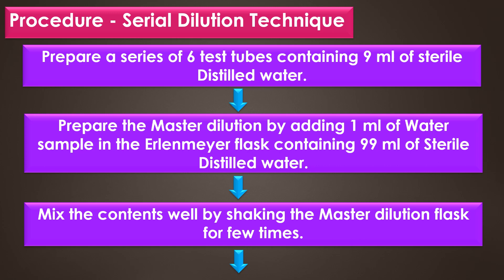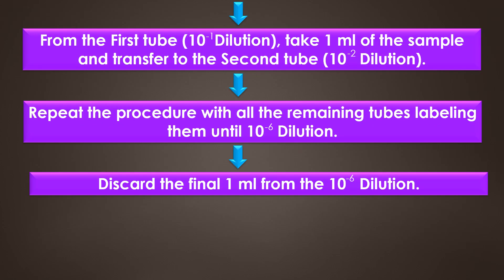First, prepare a series of 6 test tubes containing 9 ml of sterile distilled water. Prepare the stock dilution by adding 1 ml of water sample into the Erlenmeyer flask containing 99 ml of sterile distilled water, then mix the contents well by shaking the stock dilution flask for a few minutes.